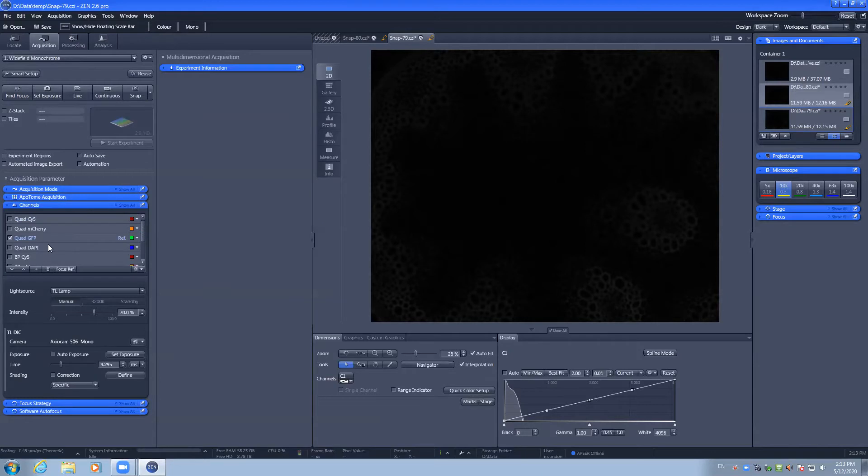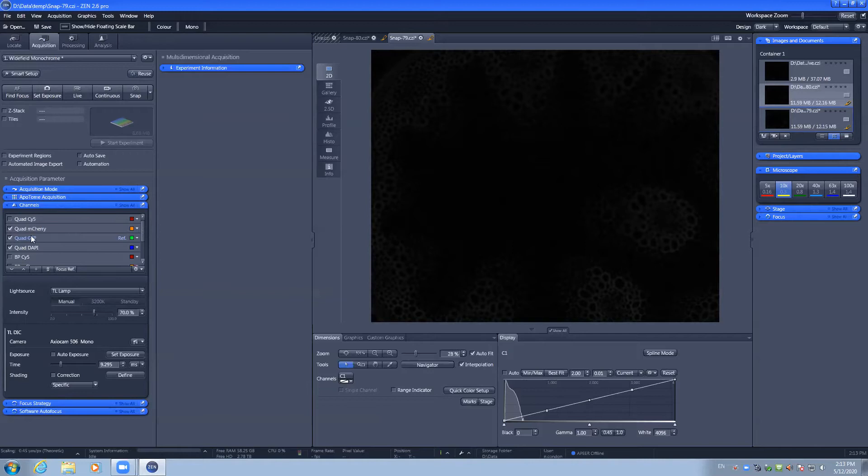Quickly getting an image on the screen can be done by ticking on the channels that you are interested in imaging, in this case the mCherry, GFP and DAPI channels.